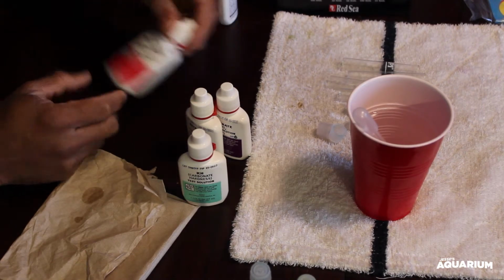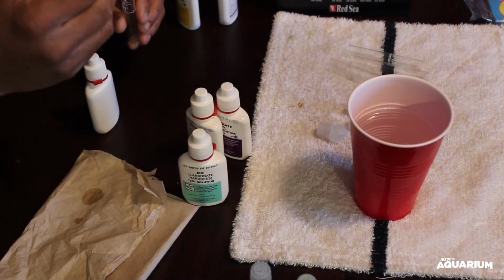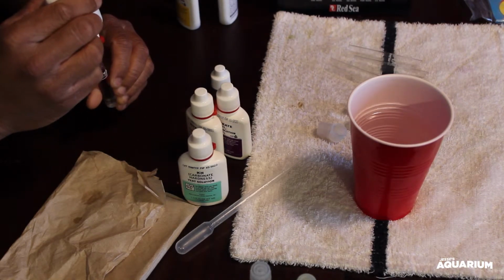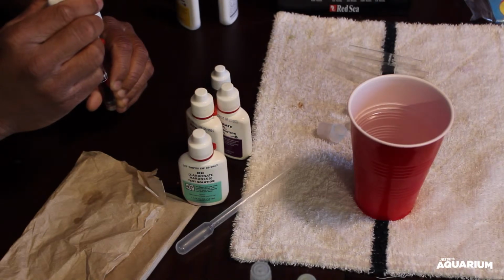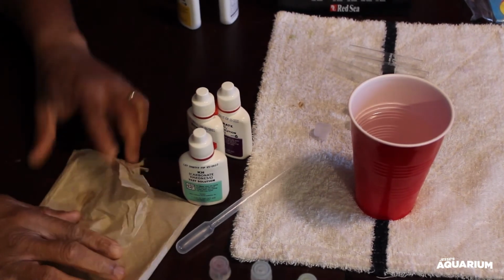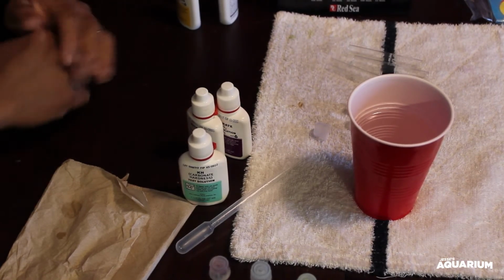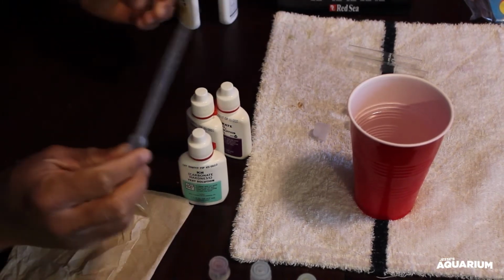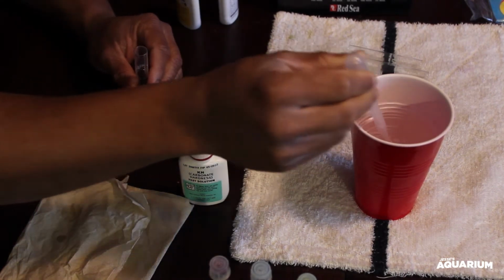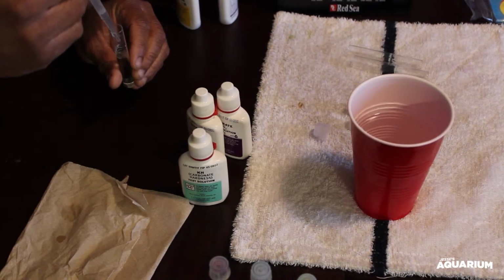Next one we'll do is a high range pH test. We'll see exactly where our pH is at right now. We'll add 5 drops of this solution. We'll let this one sit. Now with the pH of API, it says you don't have to wait 5 minutes, but I generally let it sit aside while I'm waiting on the other tests to finish running their chemical solution. It's not going to change anything by letting it wait a little longer. So hey, just leave it as it is. Alright.